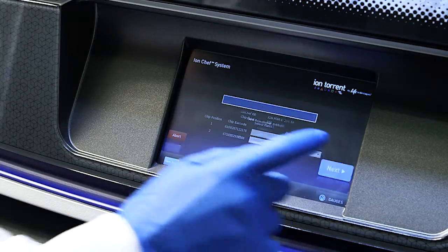The Ion Chef system takes it from there. Ion Chef contains an advanced visual system that acts as both a camera and a barcode scanner to register consumables that are actually on the instrument system. Run information is read from the sample tubes and is matched to the chip and the reagents that are going onto the instrument during that run.